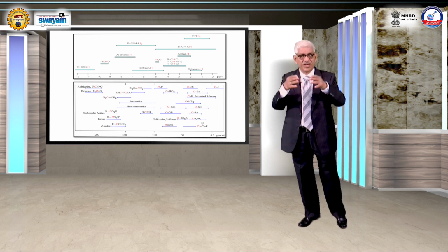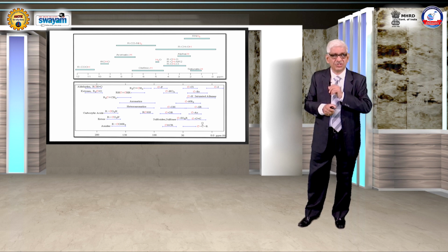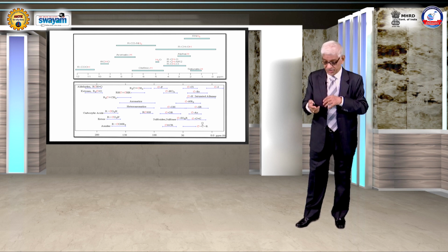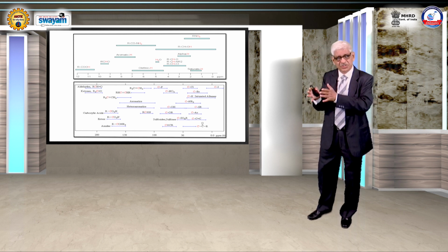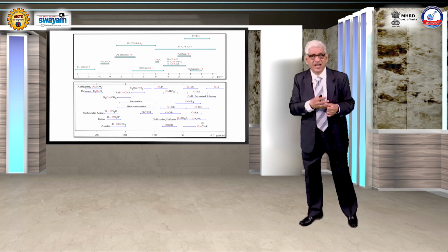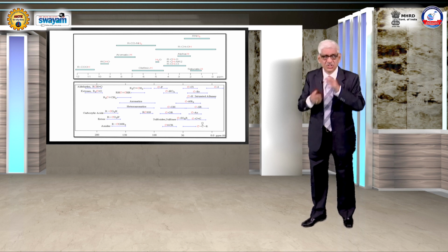This is called different chemical shifts, and these numbers are very characteristic of the molecular structure and what is present as a substituent in your molecule. So in this you can see the various substituents which are there in the molecule produce peaks at different chemical shifts, and this is a very characteristic feature which will allow a chemist to understand what molecule he has and whether what he has synthesized has these particular groups or not. This was for the protons.